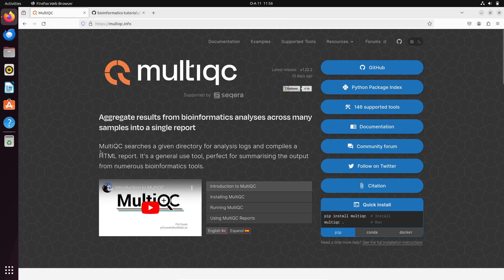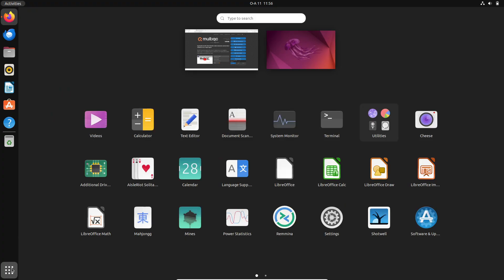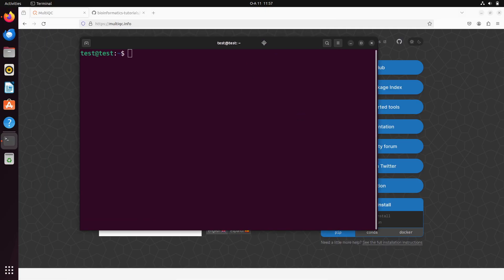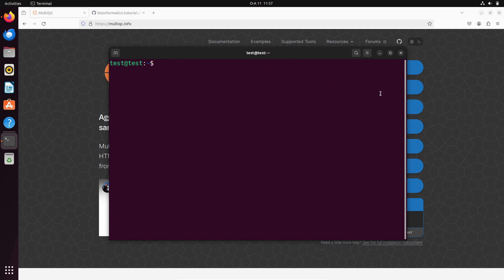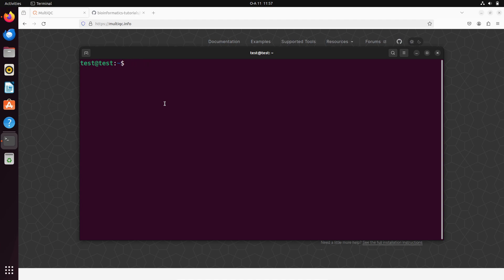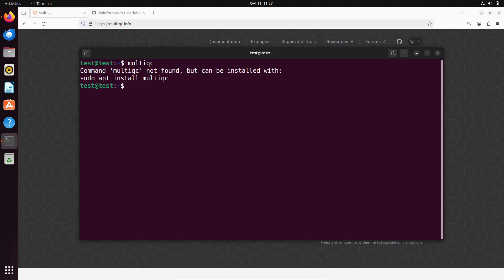Let's get started. First of all, let's open our terminal and proceed. If you open your terminal and type 'multiqc', it's going to tell you 'command not found'. It will also give some additional information, but that's fine. What we are going to do now is install MultiQC.